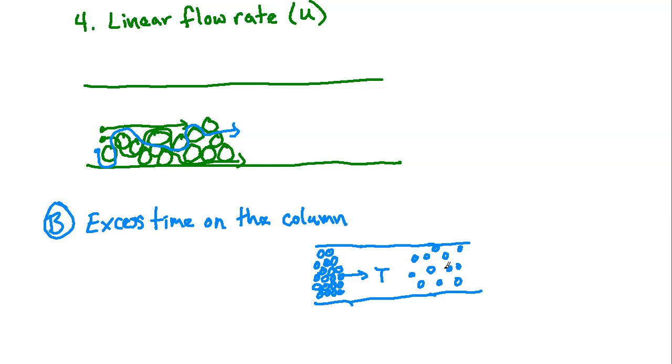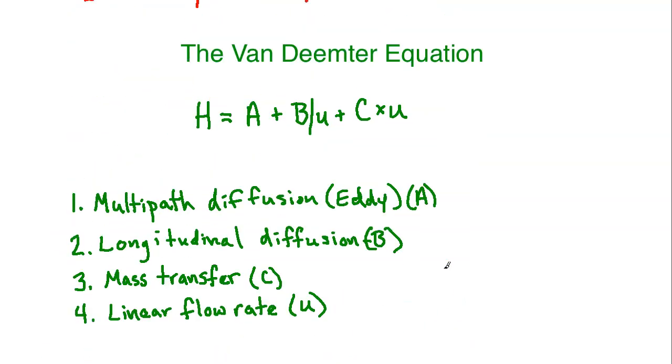So when we start talking about your flow rate, okay, and we'll talk about this more in the how do we minimize section, but if you go back up here and you look, having flow rates that are relatively small, which means a low flow rate, okay, is going to increase this number. So what does that mean? Let's think about that logically. If my flow rate is very tiny, let's say it's 1 milliliter per minute or half a milliliter per minute, okay? If this is a tiny number, then B is going to balloon up. It's going to get larger in its factor.